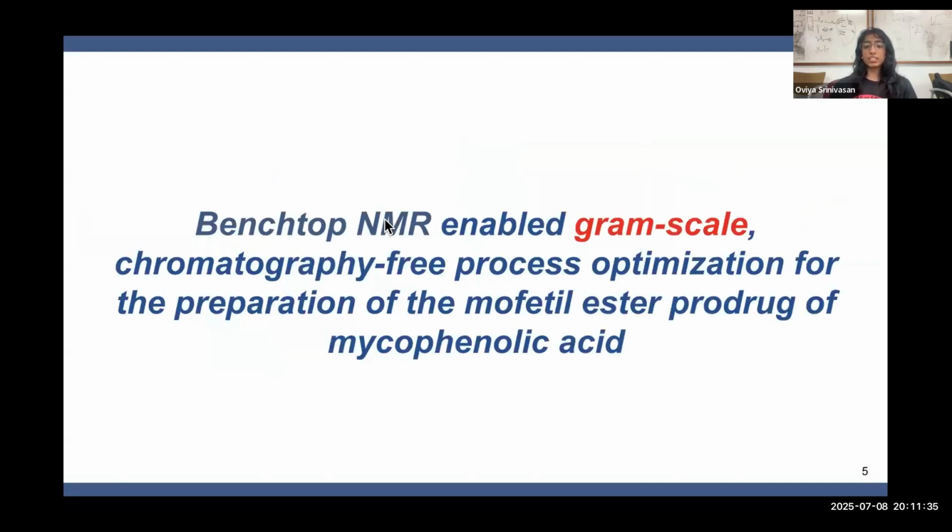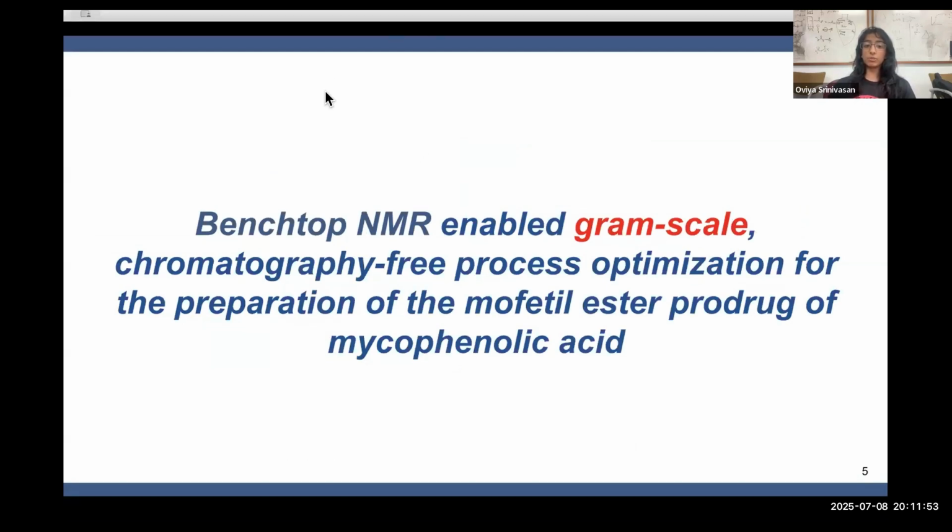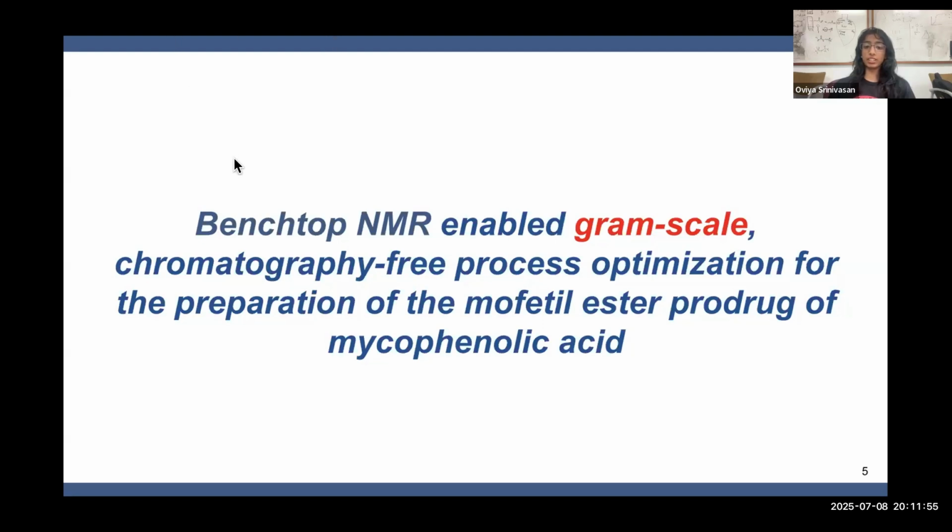When it comes to synthesis, there is always a loss in product, especially in multi-step ones, as well as difficulty in producing scalable yields. In every transfer of material, at least a few milligrams are lost every time. In this case, aiming for a simple synthesis allows us to prioritize sustainable yields, where we are able to produce multiple grams of product suitable for industry operations.